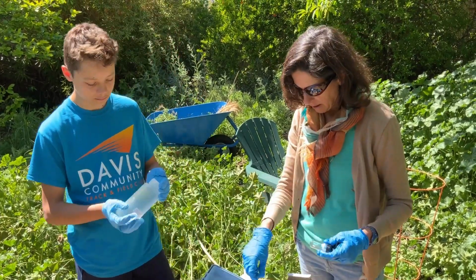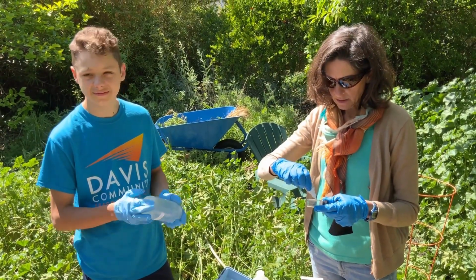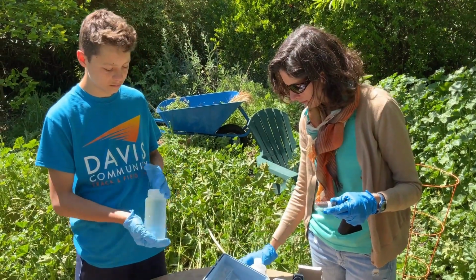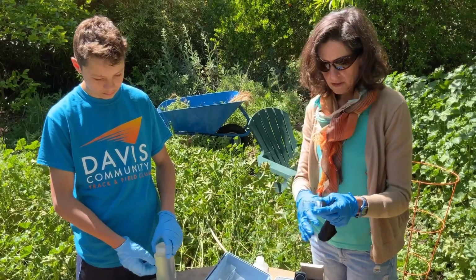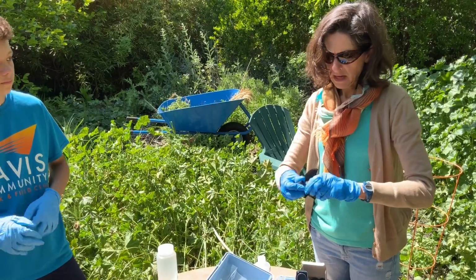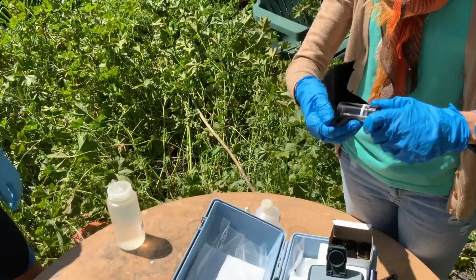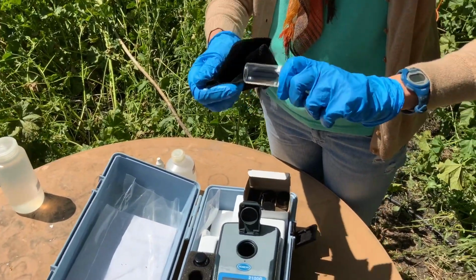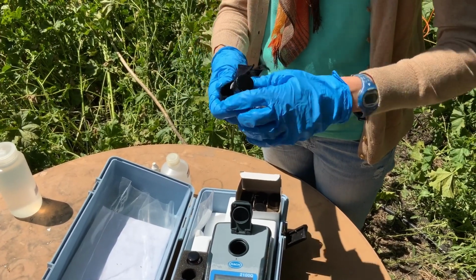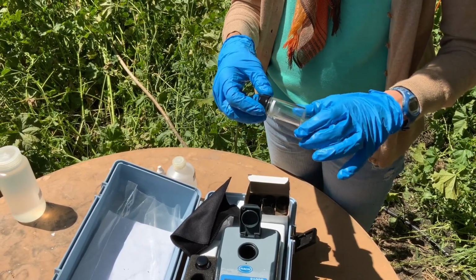And while he's doing that, I'm going to put a little oil on here like I did for the last one. I gave it a little cleaning before dropping my oil, to make sure that there weren't any fingerprints on it. It looked like there were some calcium deposits, I think, from the water that I washed it in, and maybe some fingerprints. But you want it to look nice and clean, because anything on the side is going to possibly cause bad readings.